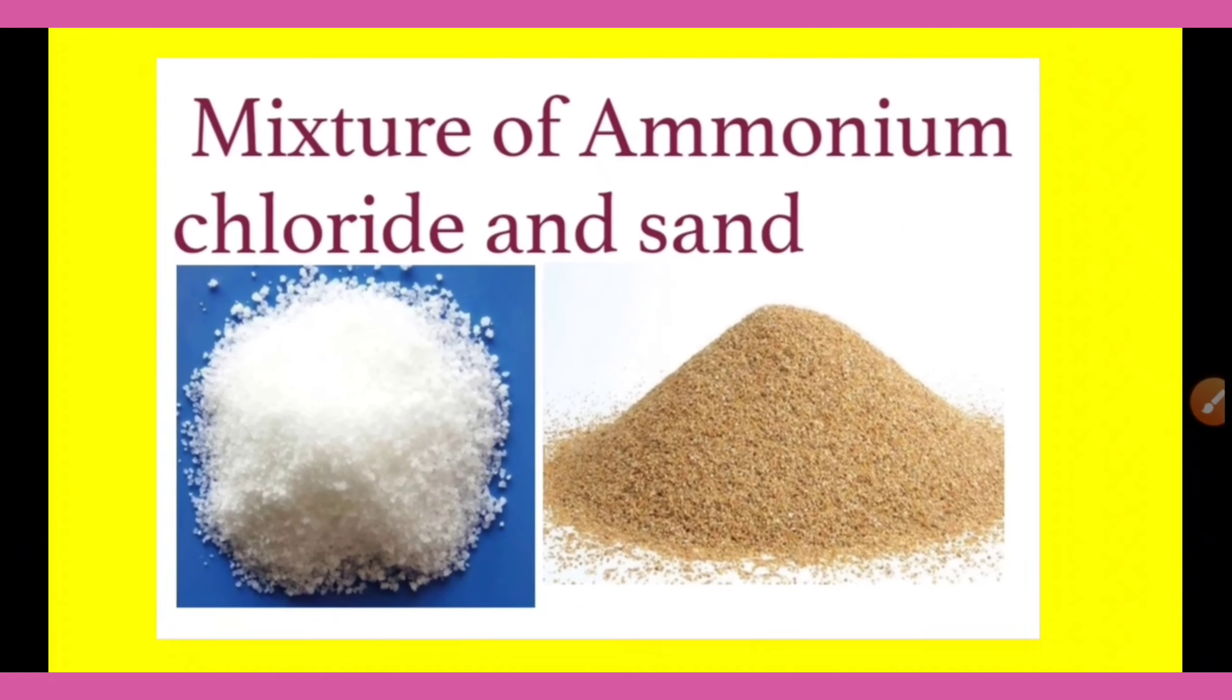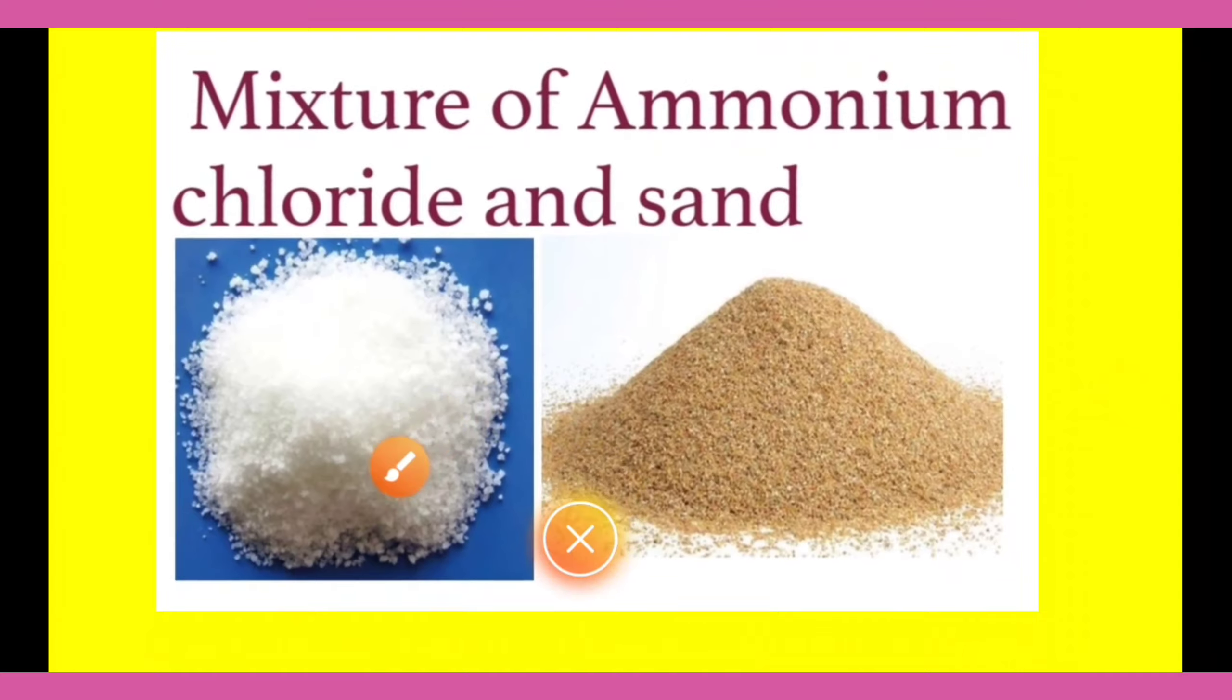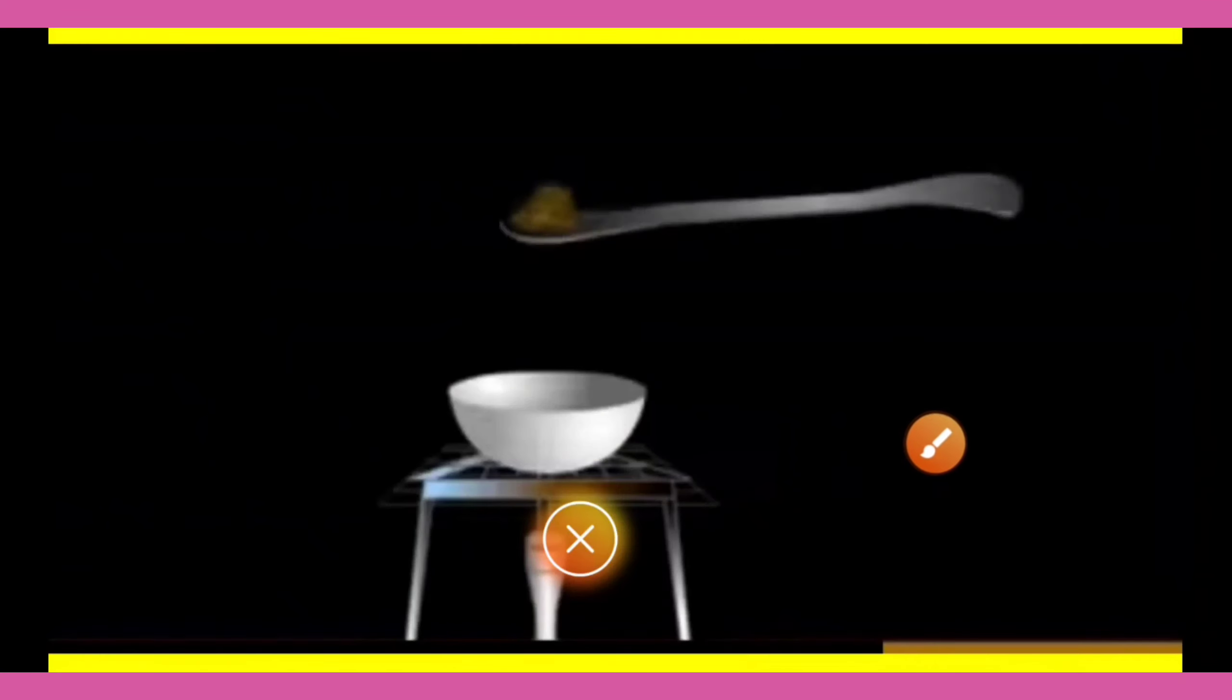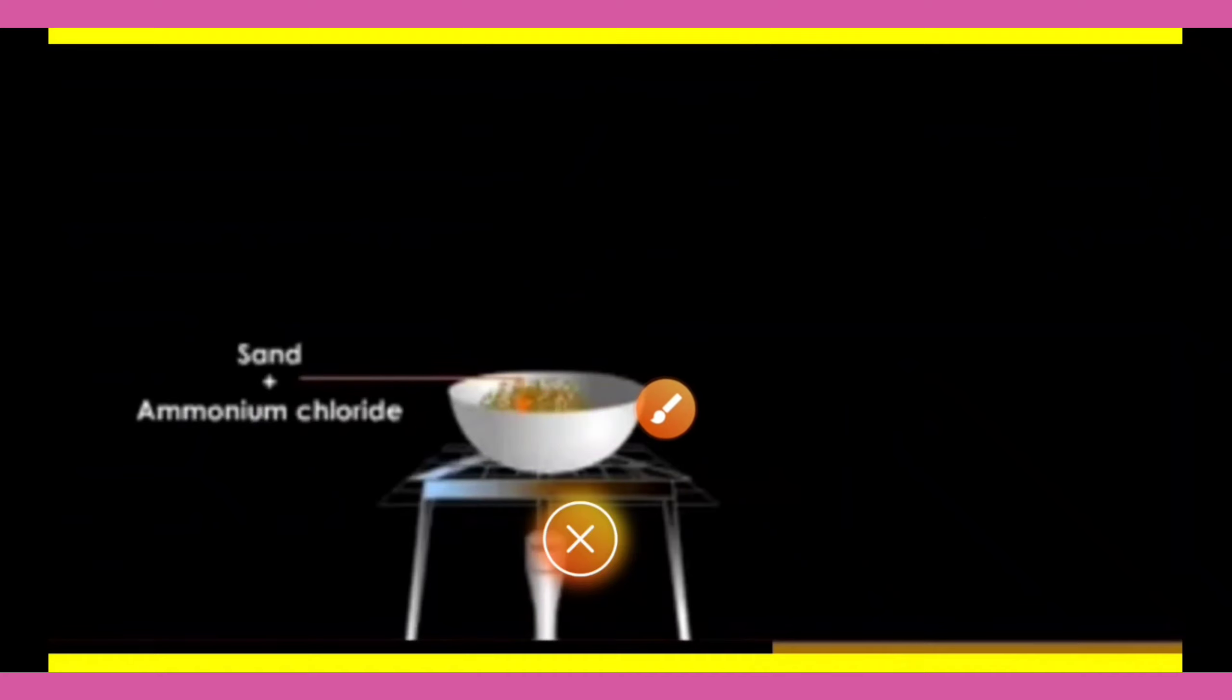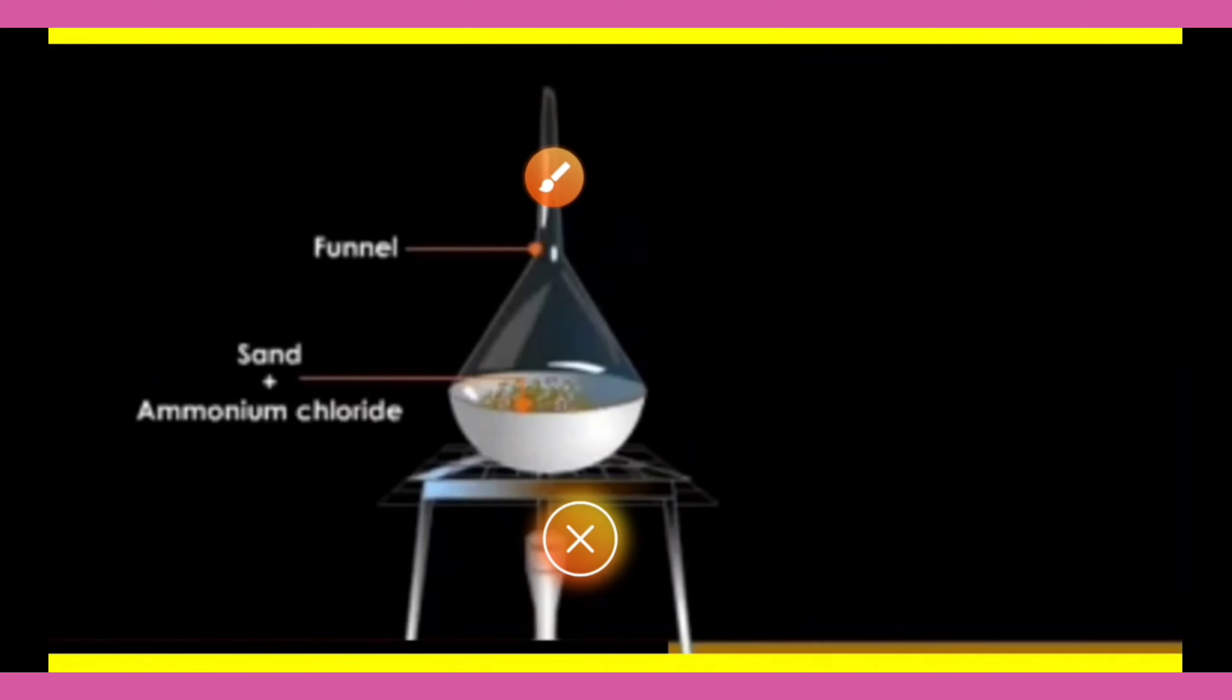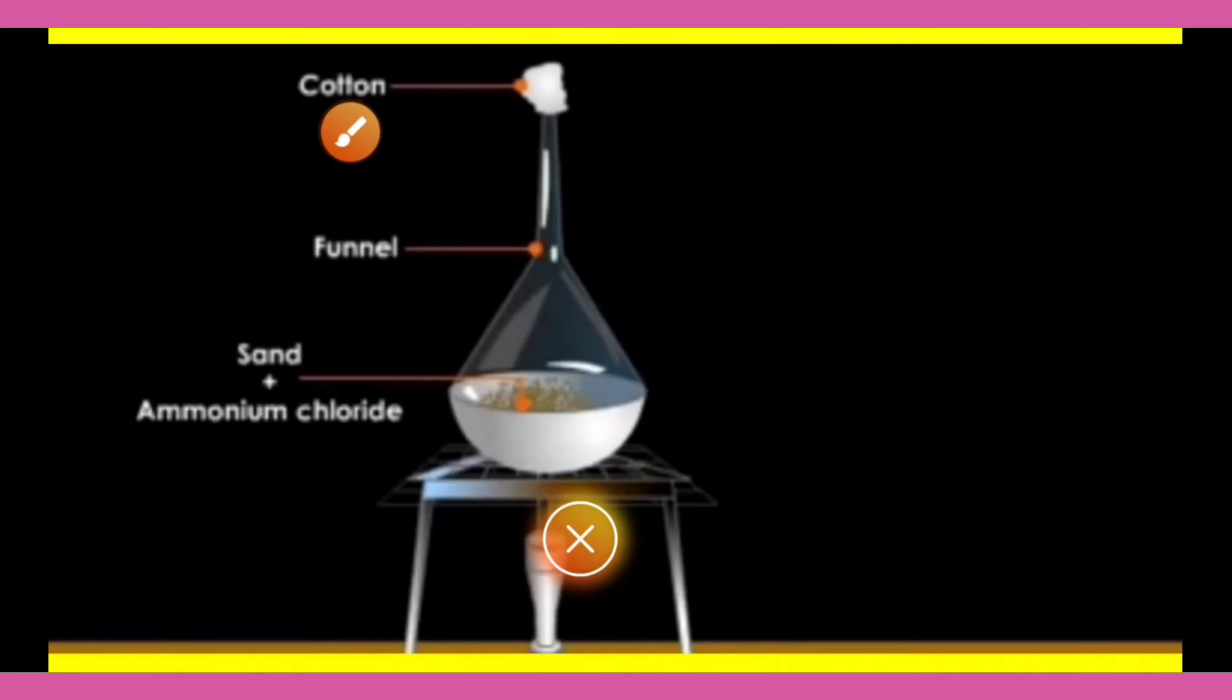Let's learn about sublimation by using an experiment. We are going to take ammonium chloride powder and sand. The powder mixture of ammonium chloride and sand is taken in a china dish and covered with an inverted funnel. The open end of the stem of the funnel is closed using cotton. Then, the china dish is heated.